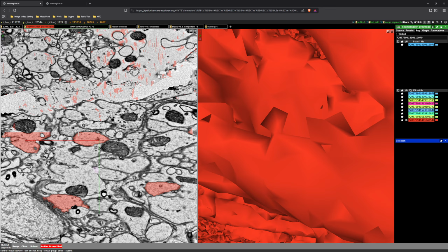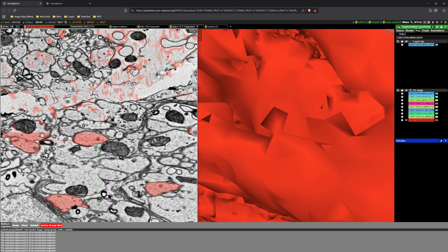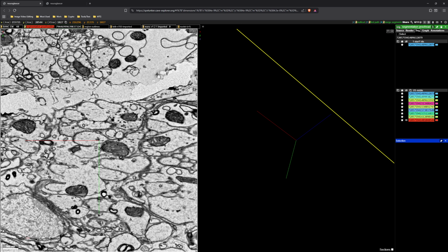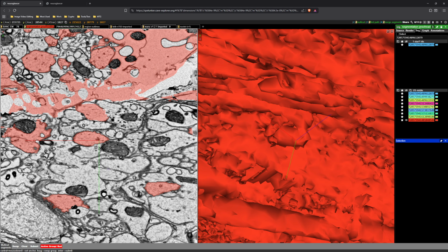We're going to attempt the 2D style. We're getting an error. The selected supervoxel is of an unselected segment. Interesting. Let's just refresh. We're going to go back to the cut tool. We're going to clear it. That should work.